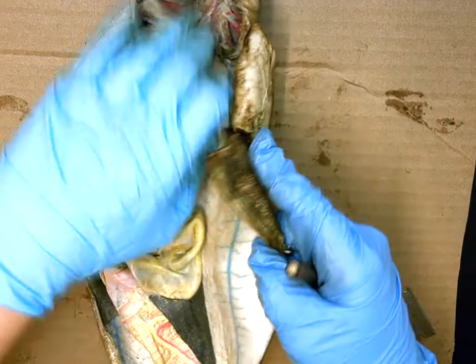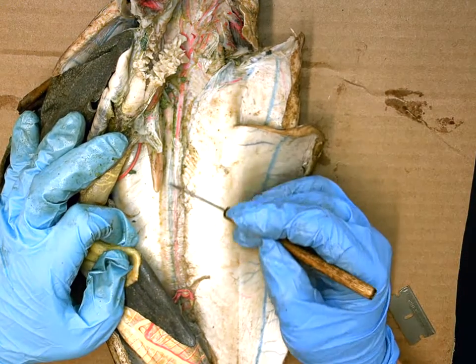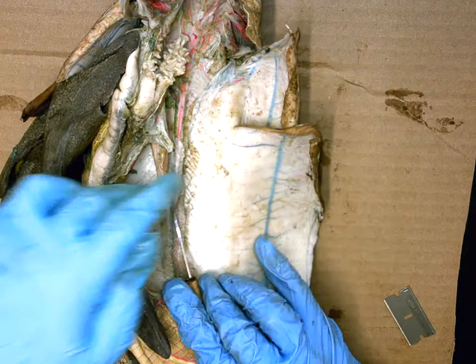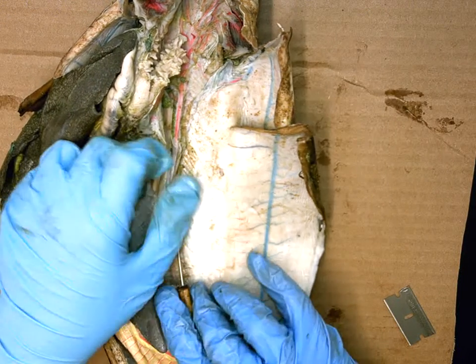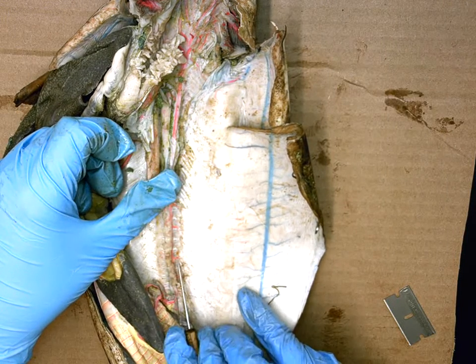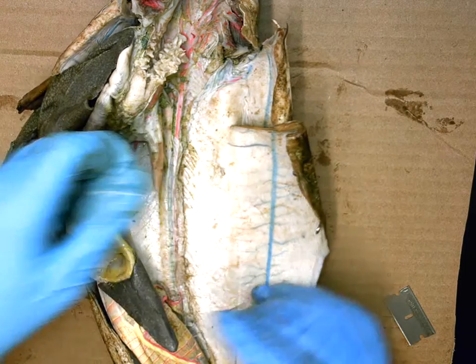Going back to the dorsal aorta, it continues further posteriorly. If you lift up the kidneys from the back wall, you can see many small pink vessels underneath — these are all called the renal arteries.